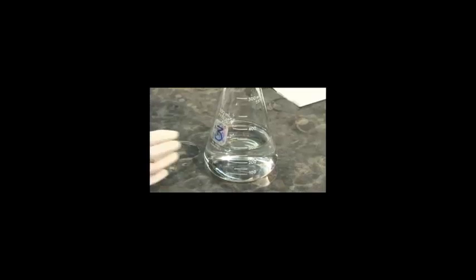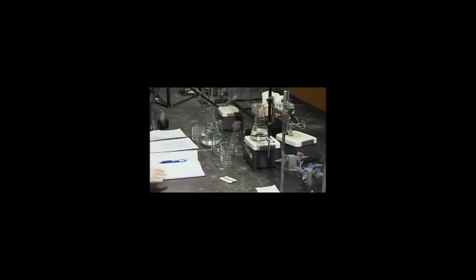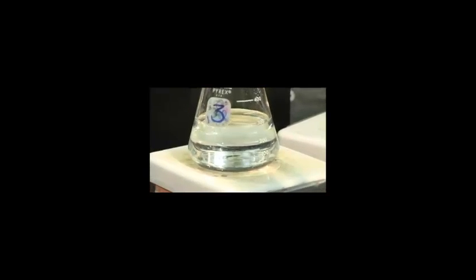In step 7, we're going to heat up our solution to about 55 or 60 degrees, and then we'll complete our titration going drop by drop until the solution becomes pale pink in color.